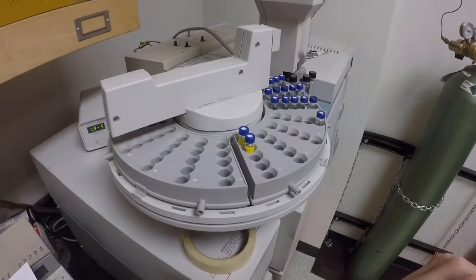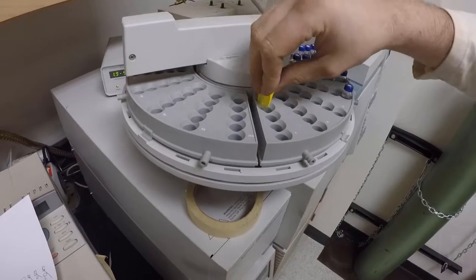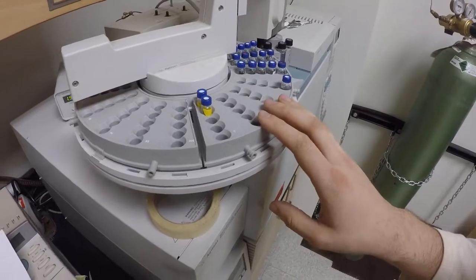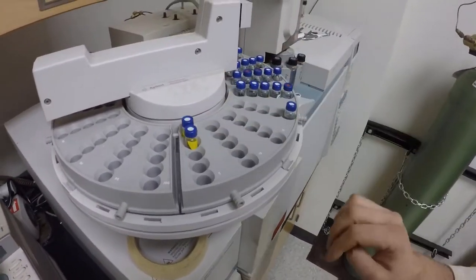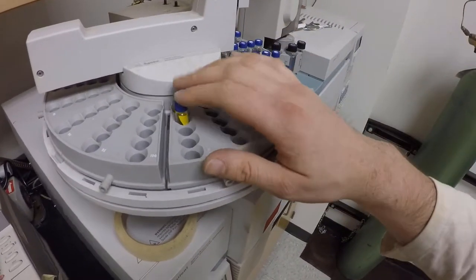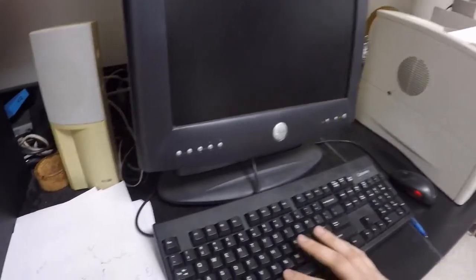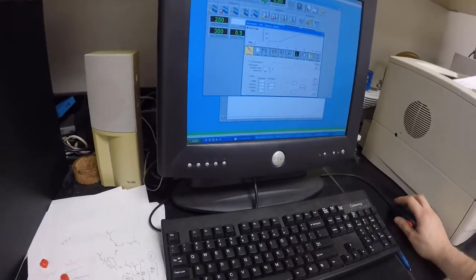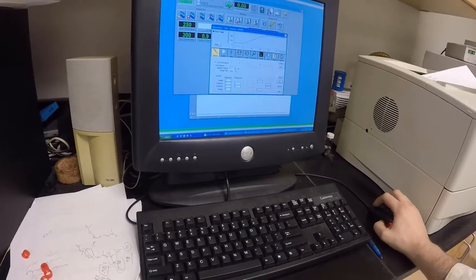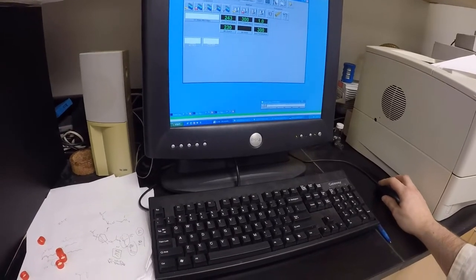Okay, so I got a couple of samples here. I have them in spots 1 and 2 in the auto sampler's tray. And so I want to program the computer to actually take these samples and use them in the right method to get them to be read. So I have them in the right spots, they're already prepared, and now I'm going to go over to the computer, look it up, and close out of everything that's open already. We can always get back in.